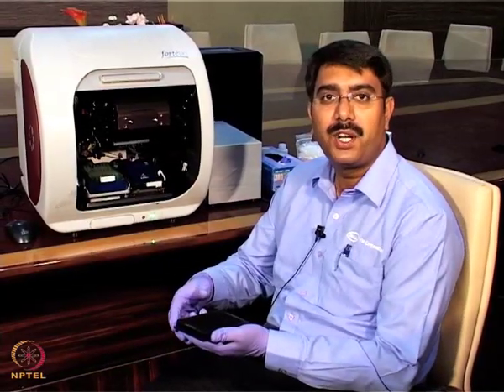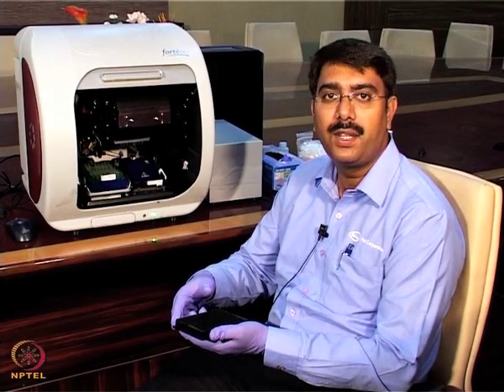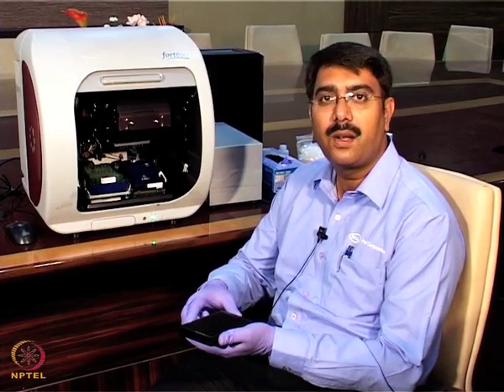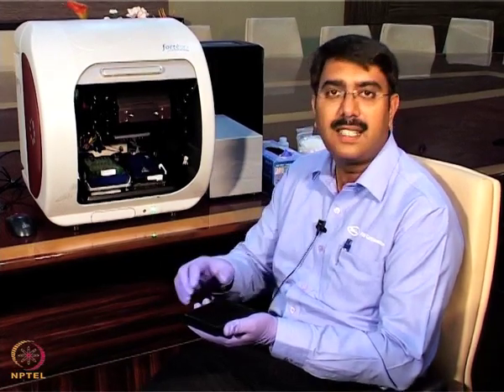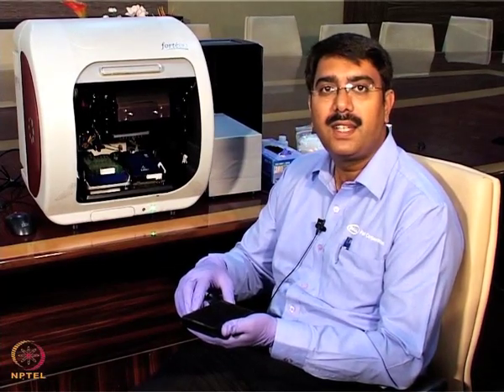I'm going to demonstrate the kinetics interaction of the mouse monoclonal antibody to the protein A ligand. Here I am using biotinylated protein A as a ligand, at a concentration of 10 micrograms per ml. I am putting 10 micrograms per ml into the 6 wells, and the mouse monoclonal antibody I am using as an analyte.